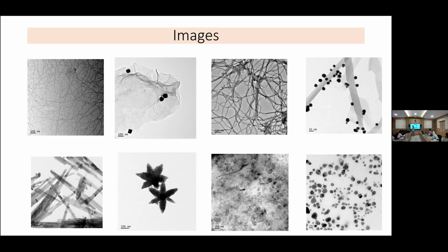You can see graphene here. So anybody can show this. There are some carbon nanotubes in the sample. Can you identify? You see here, everywhere there are carbon nanotubes. So in this sample, they put graphene, carbon black, and carbon nanotubes. So this is one of the purposes for which we go for TEM.